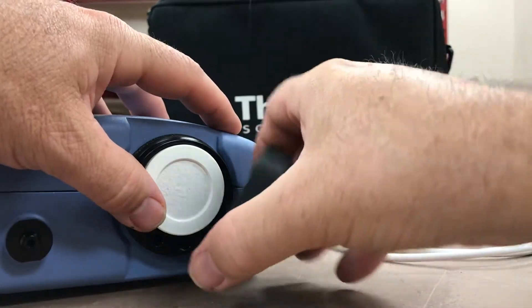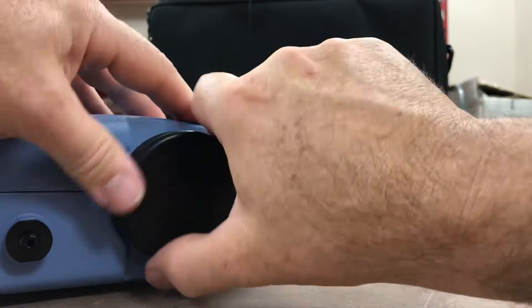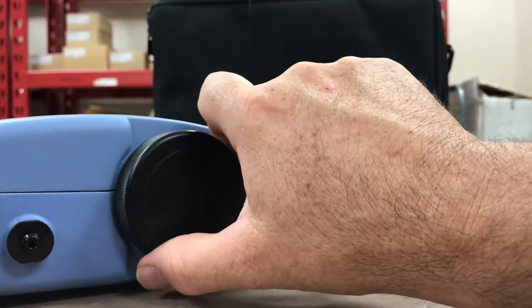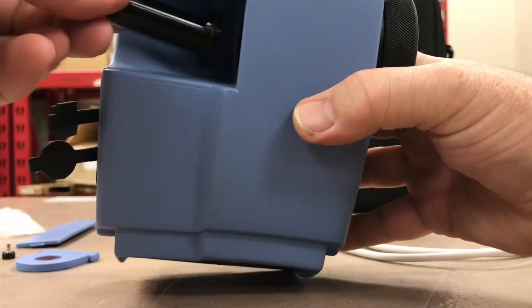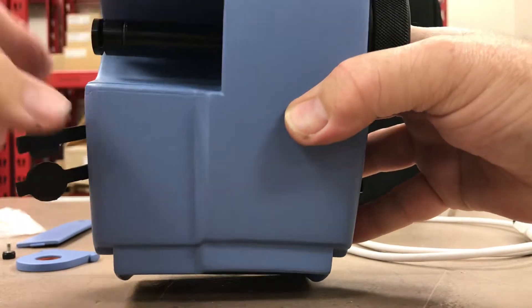Or it can be measuring with the data logger with the light scattering sensor inside of this unit, measuring real-time particulate. So you have two options of collecting particulate with this unit. You can also put the total sample inlet back inside — this view is from the top.